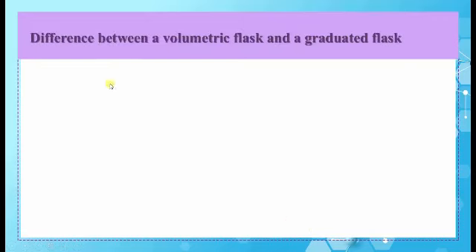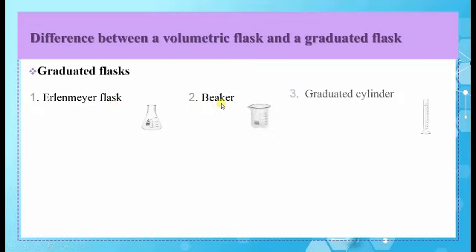Okay, let's take a look at the difference between a volumetric flask and a graduated flask. Graduated flasks are such as the Erlenmeyer flask, beaker, and graduated cylinder. The volumetric flask has a definite volume. In our case, it is 250 milliliters.